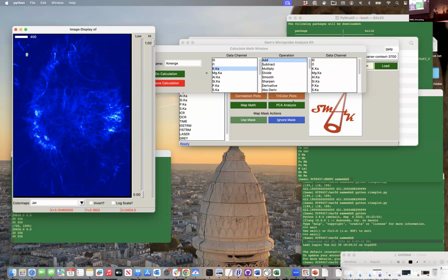So that's another great way of doing your contextual data. And you can even say, here's my data set at 7.2, it's coarse and big scale. But I really want to now show you this high res little area in the section here that I got at a different beamline at a much higher resolution than it's capable of doing. The only difference there is the coordinates are going to be different between the two beamlines, right?